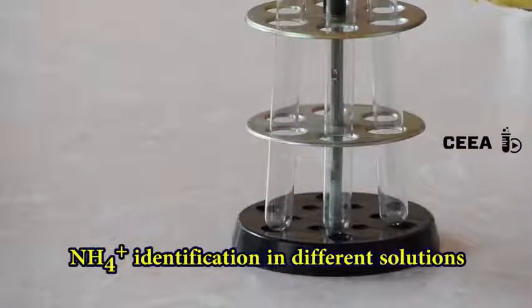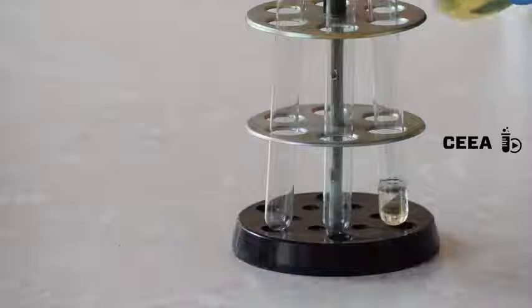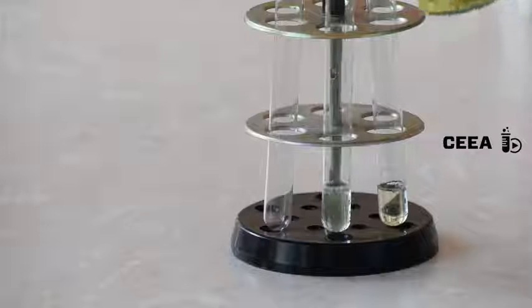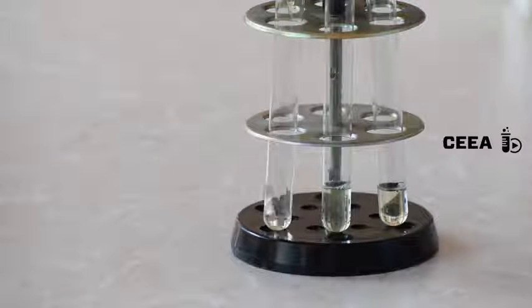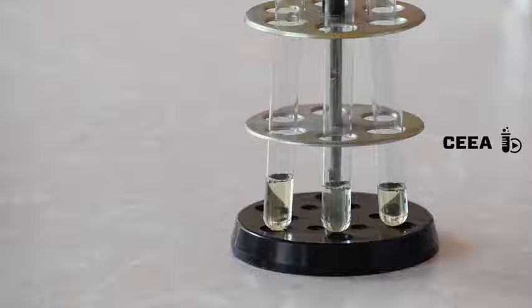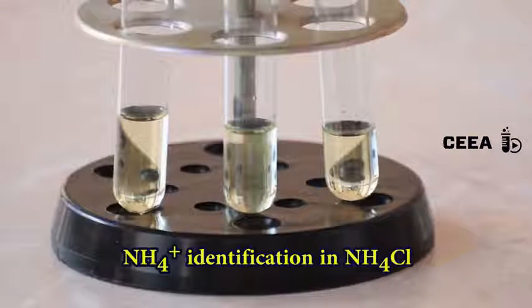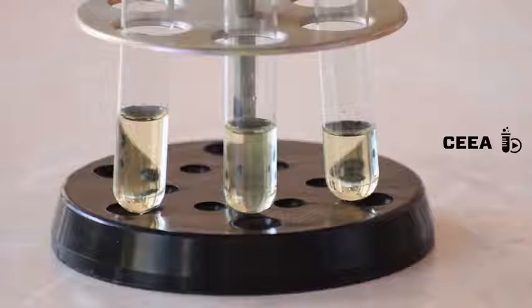For this we prepare 3 test tubes with the Nessler's reagent. We add in the first test tube a solution of ammonium chloride and we notice the brown-orange precipitate.